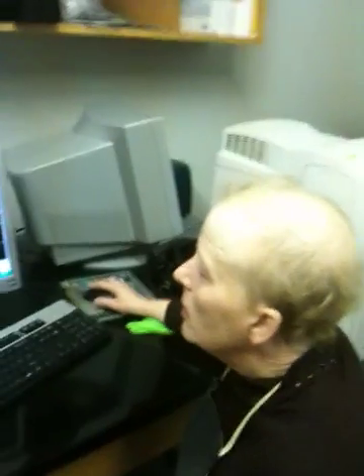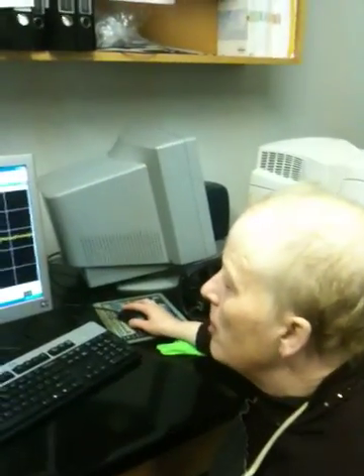I want to left-click on BSMS panel. What comes up is this grid, and it has all these different controls on it. What I want to do is a little tiny bit of shimming. Now, if any of you do carpentry, carpenters frequently use the term shim, and what it refers to is taking little pieces of wood to make a cabinet or a door frame level. You might notice that sometimes there are little pieces of wood shoved under your cabinet in your kitchen. That's shimming, right?